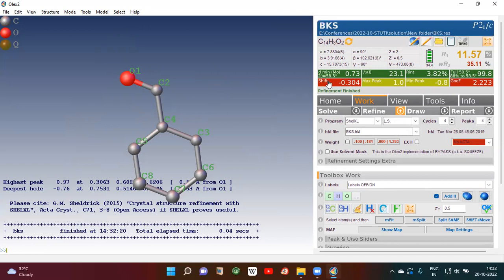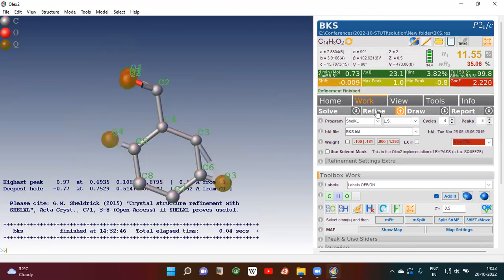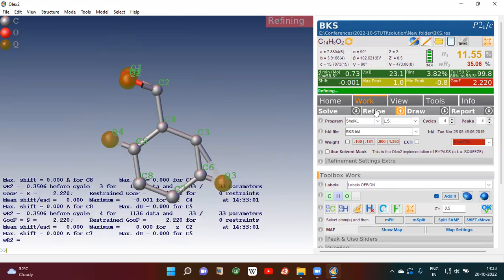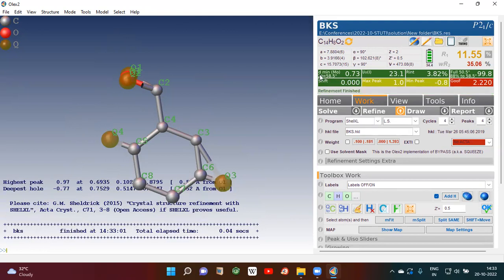When it is adjusting, there will be some values here. Once the refinement is complete, you will get zero values. So until you are getting zero values, you have to keep refining. The value has been reduced, meaning the shifting has become less. It became green color — shifting is almost zero. Now it has become zero, so the atoms are not moving anymore.